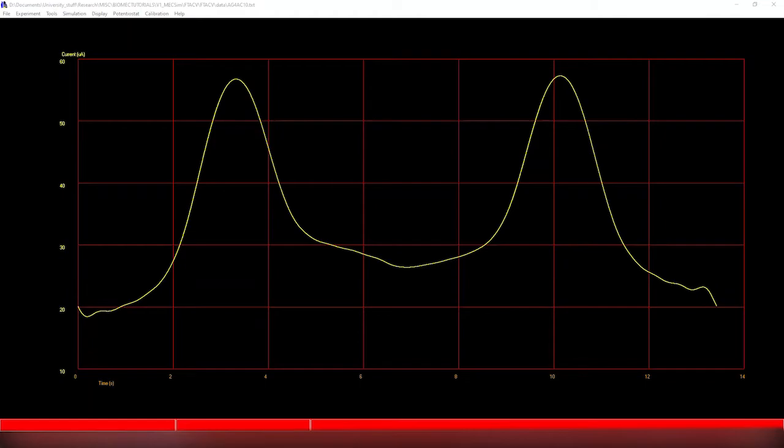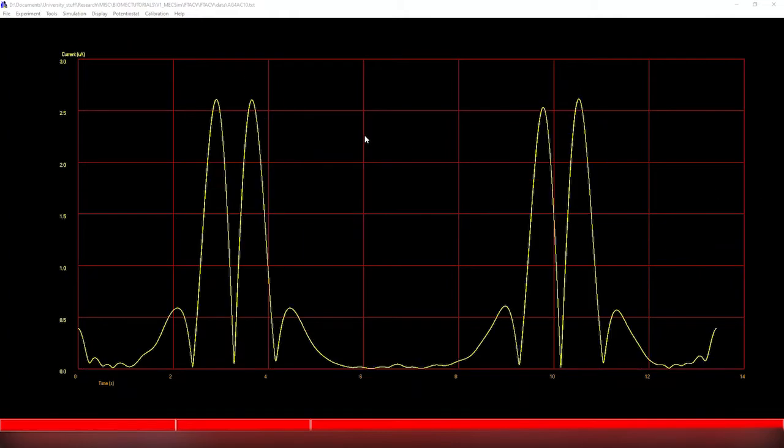When I'm choosing triplicate data, I end up looking at the fourth harmonic, mainly because it's far enough away from the capacitance that it isn't affecting the harmonics, and it's got enough of a Faradaic signal to not be that affected by just random stuff that can happen between experiments, such as distance between the working and reference, or working and counter electrode.